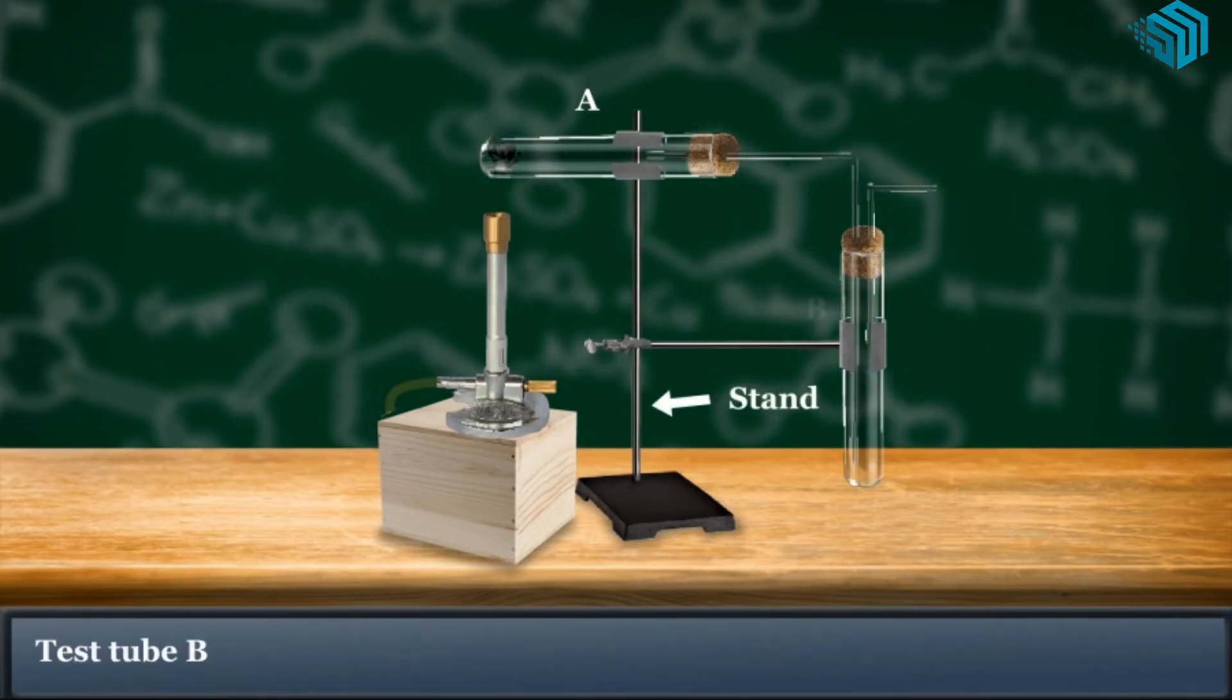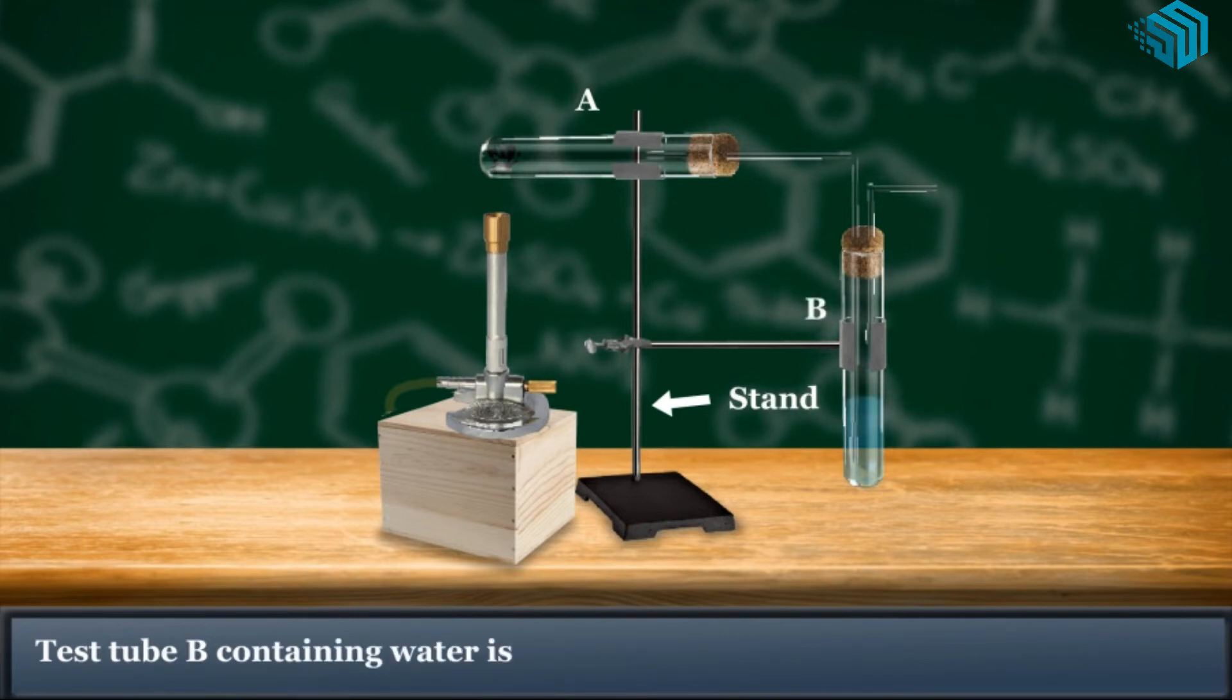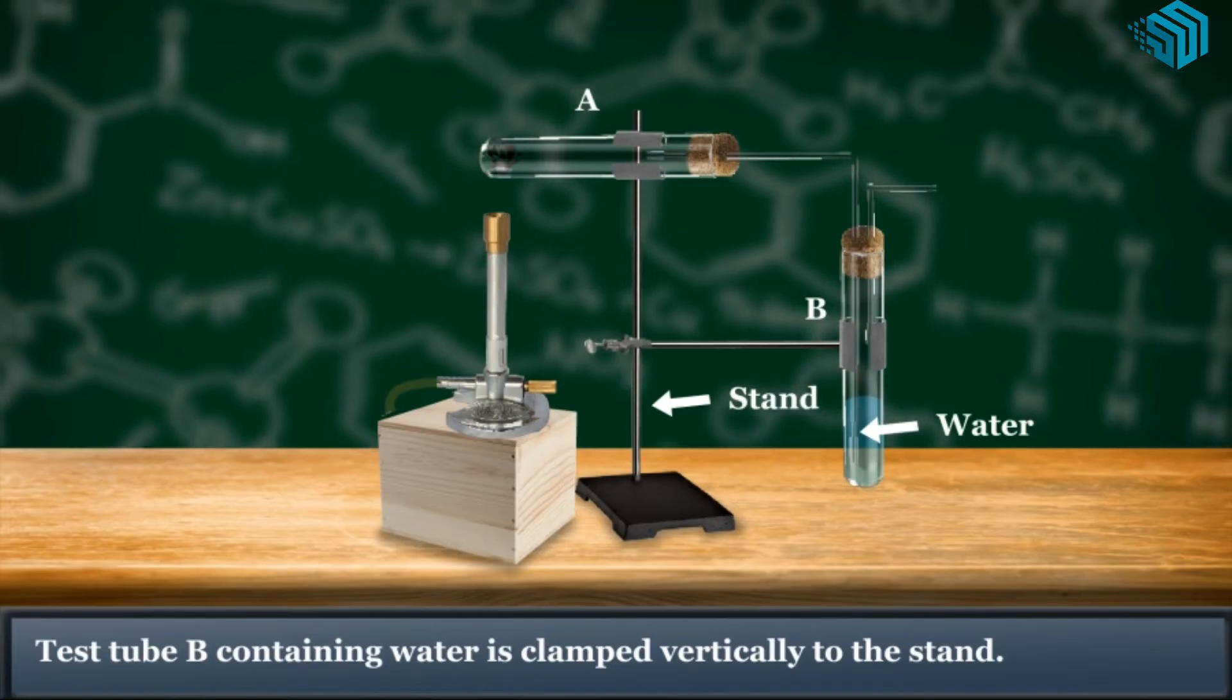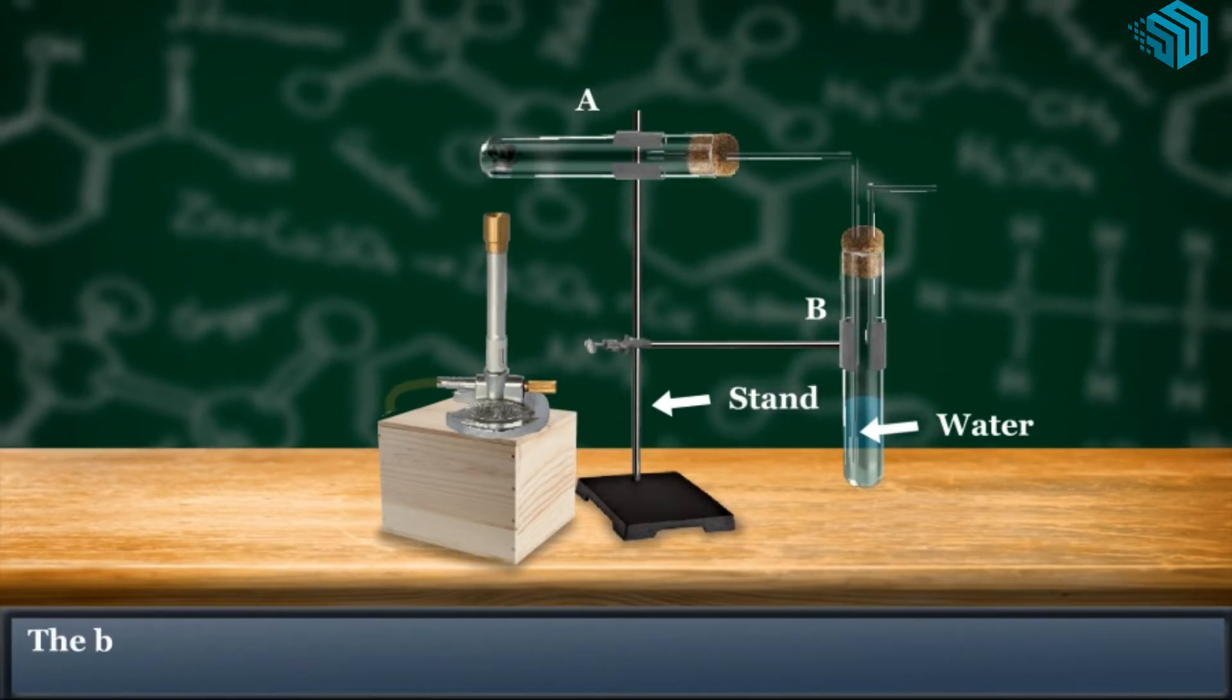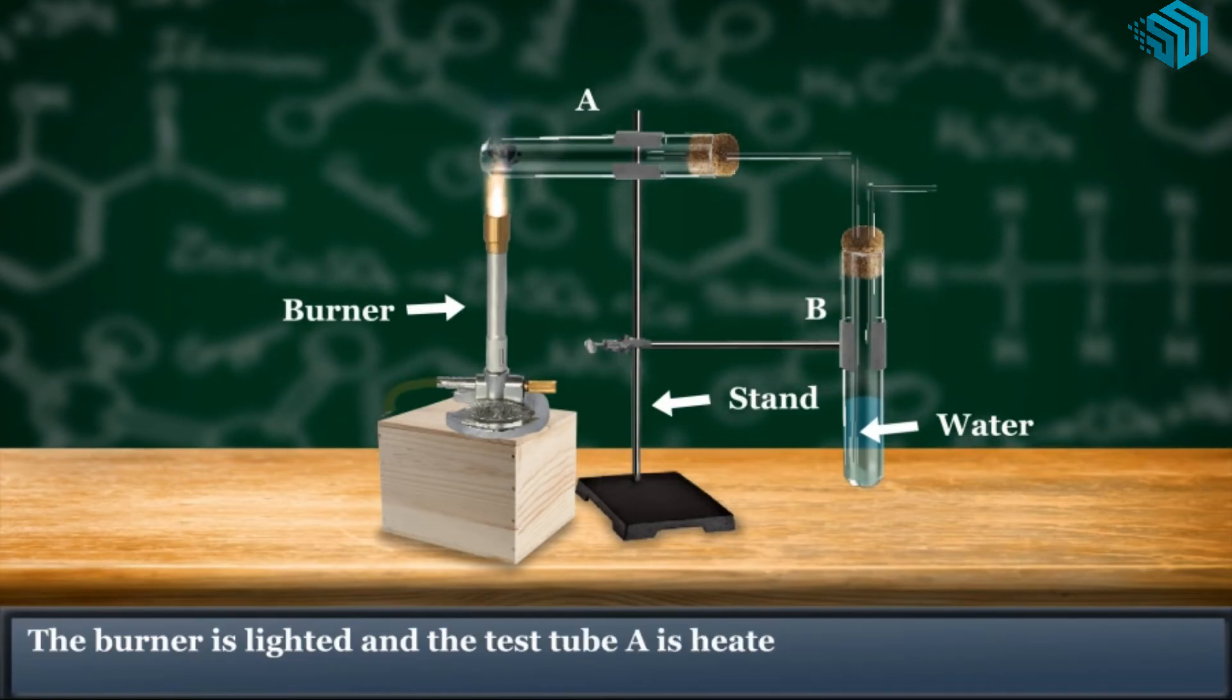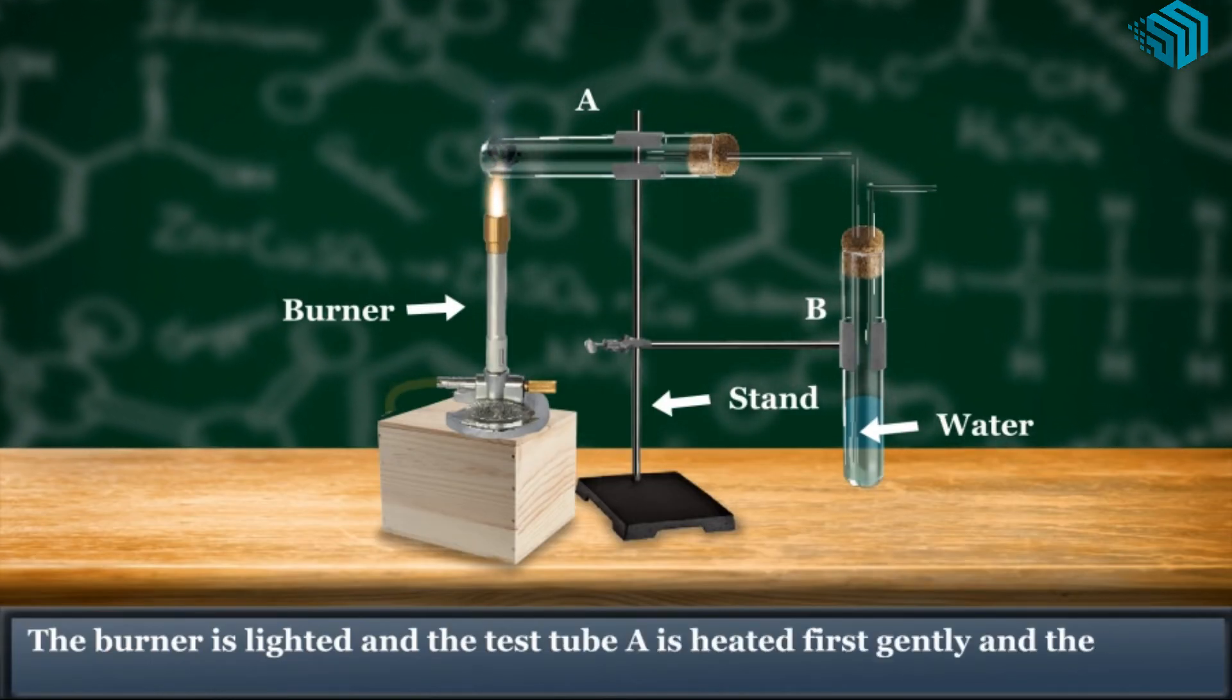Test tube B, containing water, is clamped vertically to the stand. The burner is lighted and the test tube A is heated first gently and then intensely.